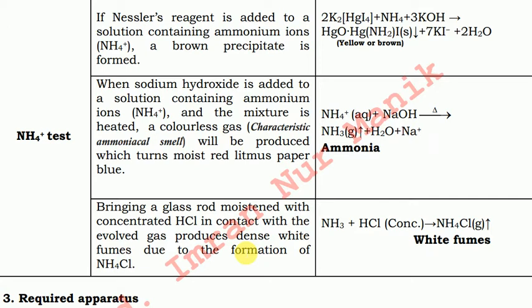That means we have to take a sample solution and heat it. Let us say we have taken a sample solution in a test tube. We are heating the sample solution in the test tube, and after heating, the sample solution will boil and produce some evaporating gas.